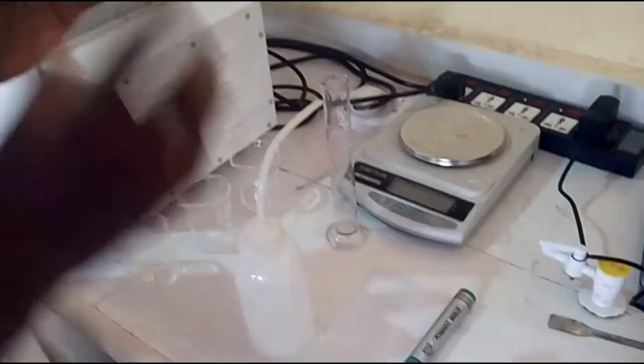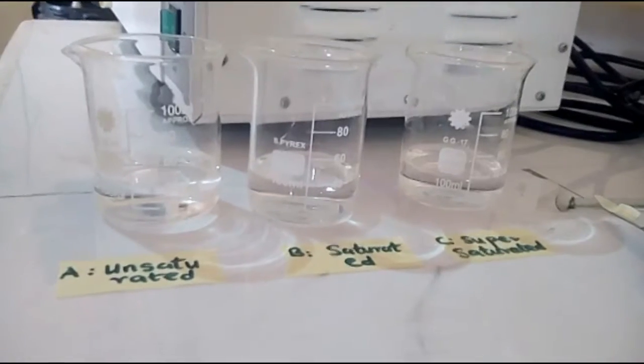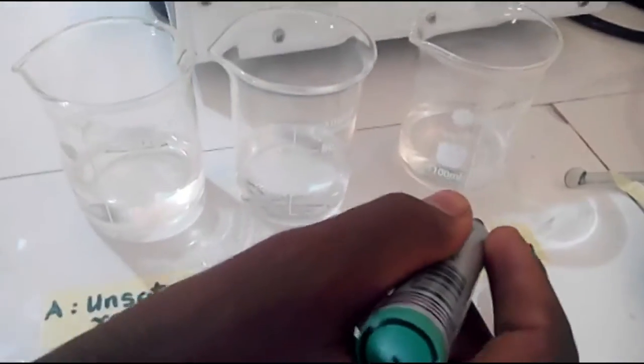Now my classmate Jafet will be demonstrating the practical. Procedures. The first step is to measure 40 cm cube of distilled water into each of the 3 beakers. A is labeled unsaturated, B is labeled saturated, and C is labeled supersaturated.